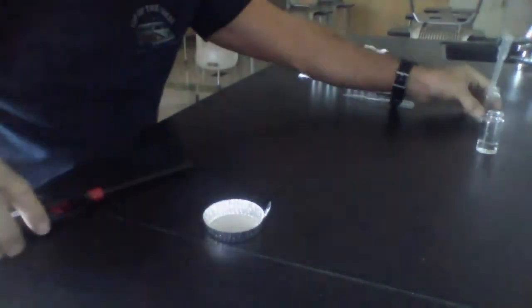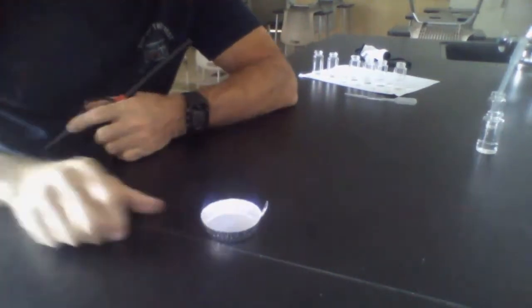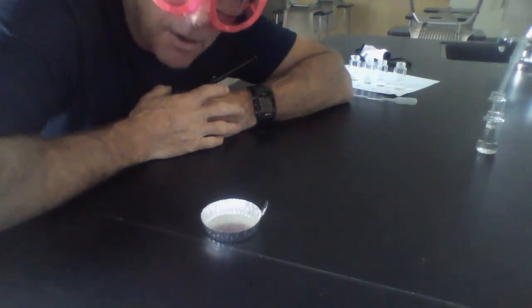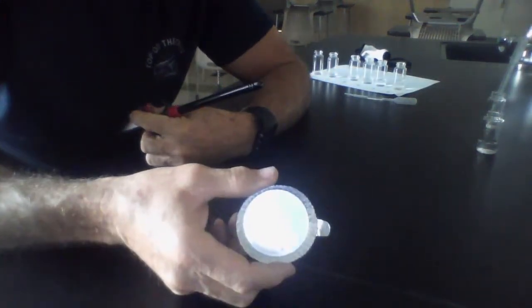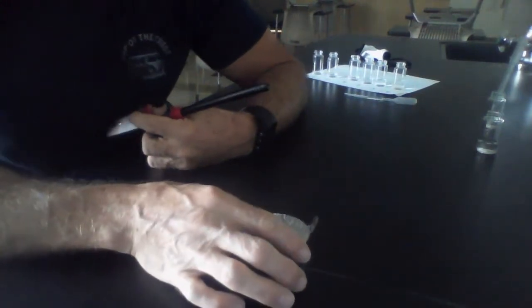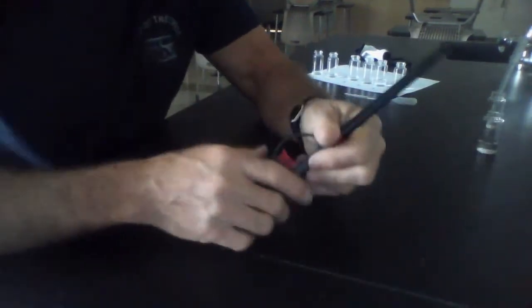Moving everything far away. 3, 2, 1, ignite. And it actually is on fire. Can you see it? I'm going to go ahead and let you describe it. Wow, gone. That burned so quickly. That is gone already. I do see a slight residue of droplets, perhaps water in there. And that was burning methanol. So let's move on to ethanol.